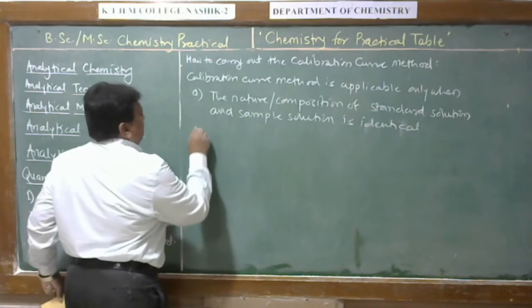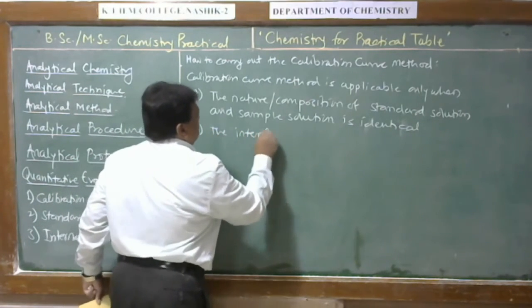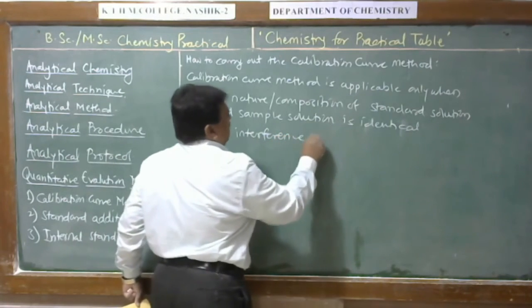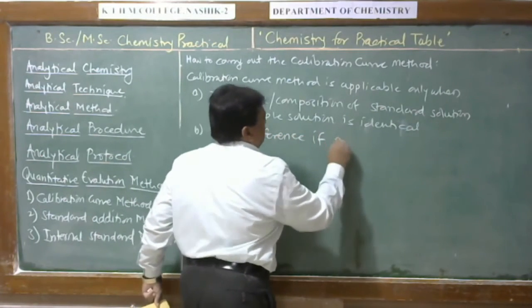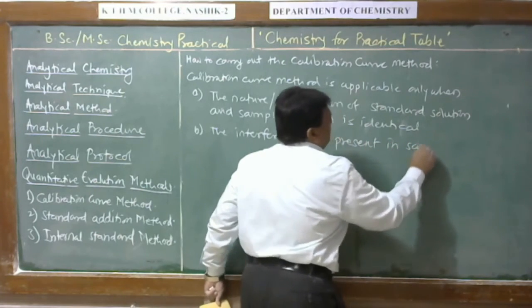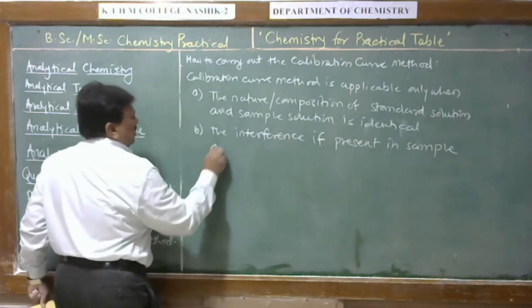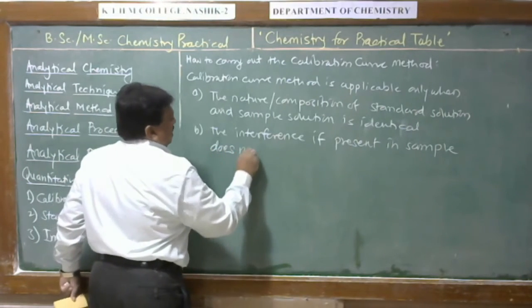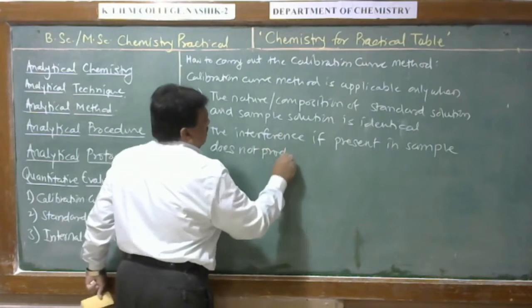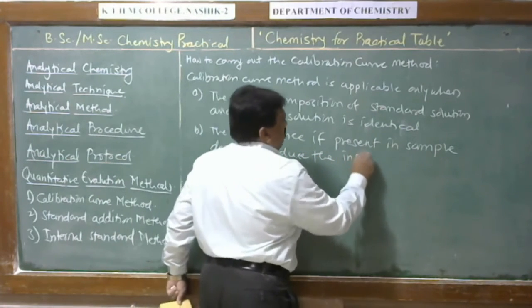Second thing is that the interference, if present in sample, does not produce the instrumental response.